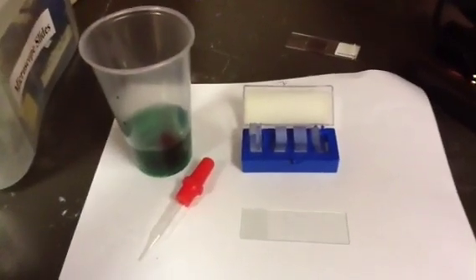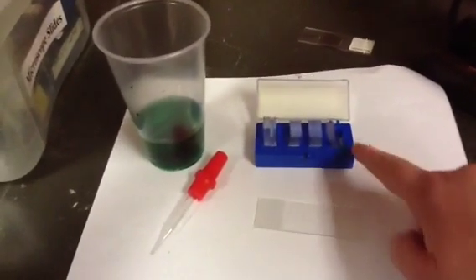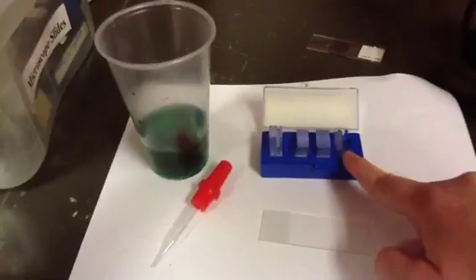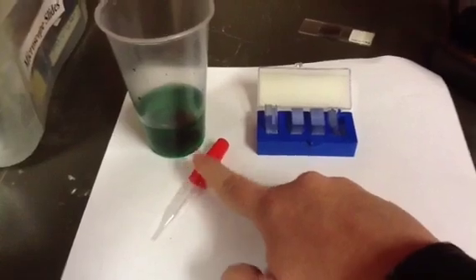When making your own slides, there's a few things that you'll need. You'll need a blank slide, which means there's nothing on it. You'll need a cover slip, which is used to cover the specimen that you're trying to look at. If you're doing a wet mount, which we'll go over in a minute, you'll need a dropper and a sample. When making your own slides, think small, like the size of the head of a pin. Huge samples will be too big and hard for you to view.